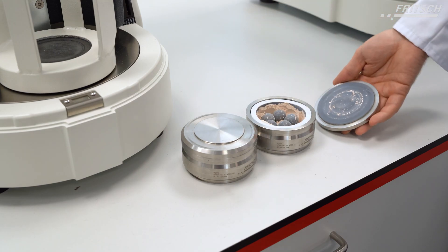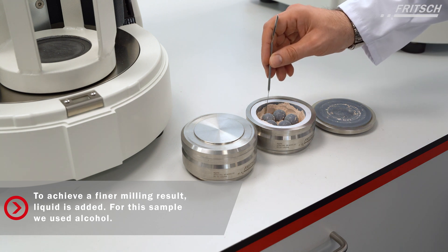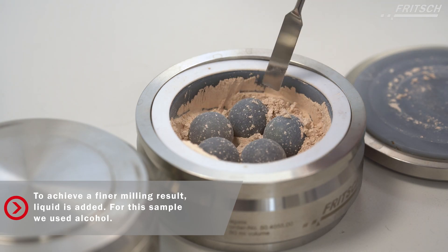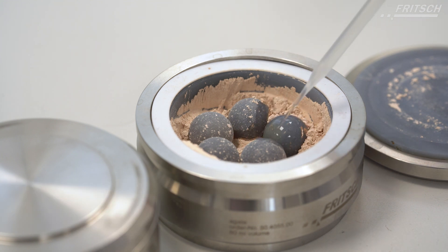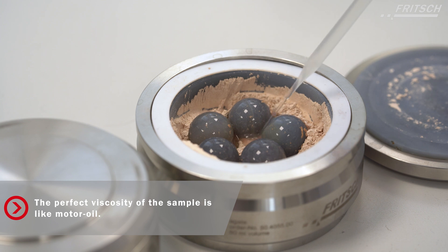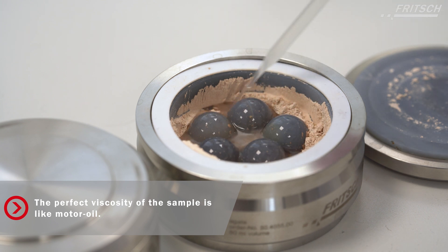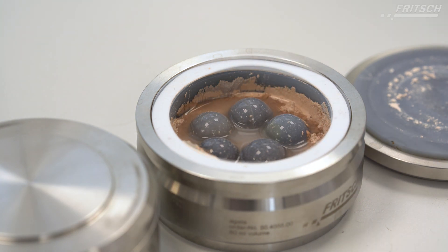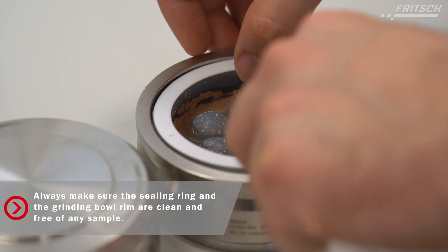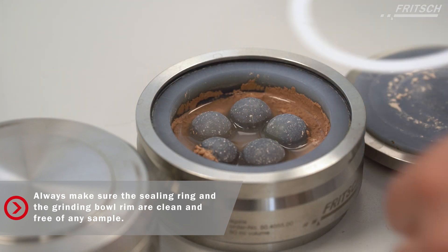To achieve an even finer result, we add liquid to the sample — in this case alcohol — but every liquid that doesn't damage the sample and has a high boiling point and low viscosity can be used. The perfect mixture should have a viscosity like motor oil. Always make sure that the sealing ring and the grinding bowl rim are clean and free of any sample.